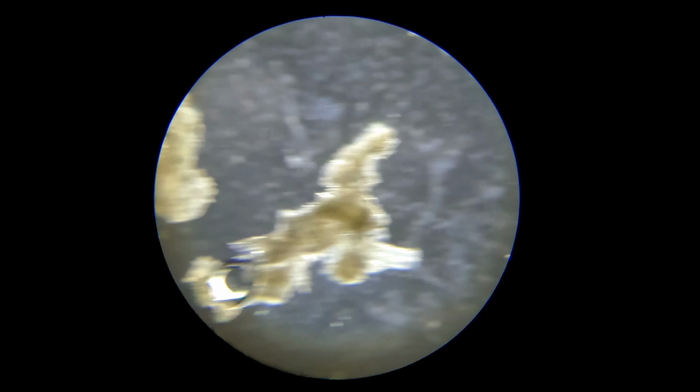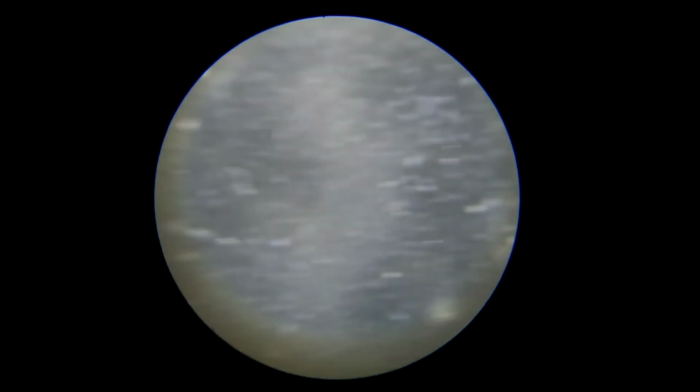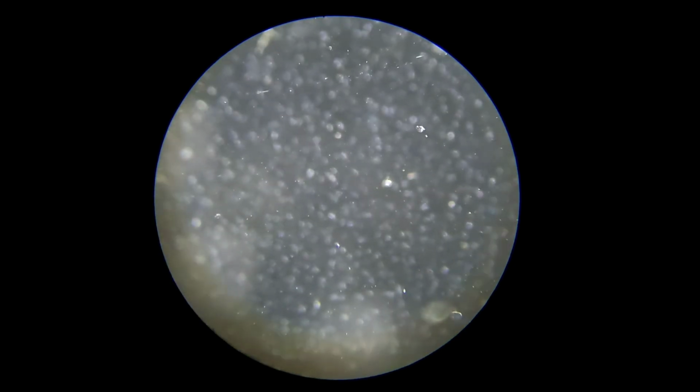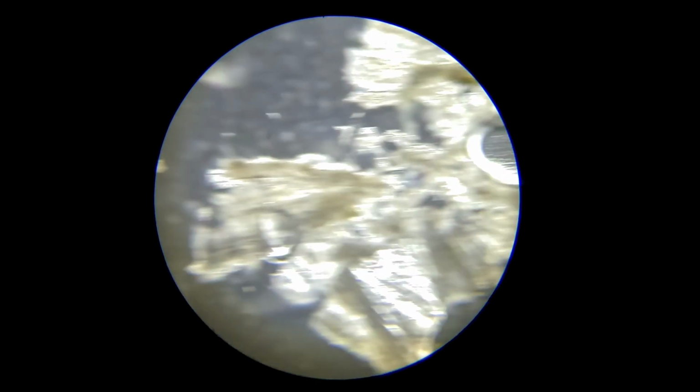But wax is just a hydrophobic coating. There is no water, no nutrients and no environment for life. These shiny or grainy structures may look alive, but they don't move, divide or respond.